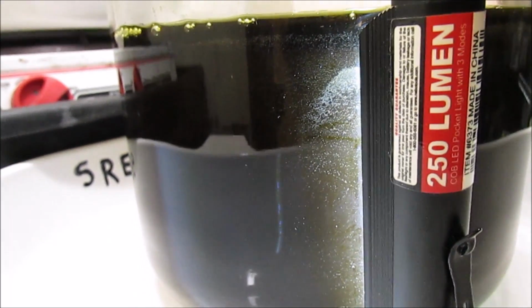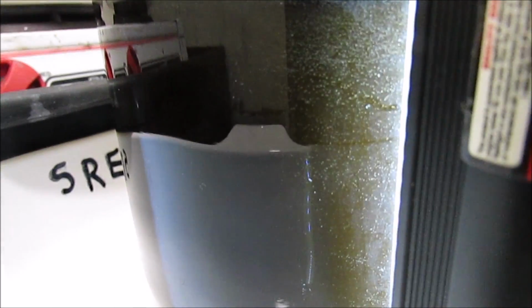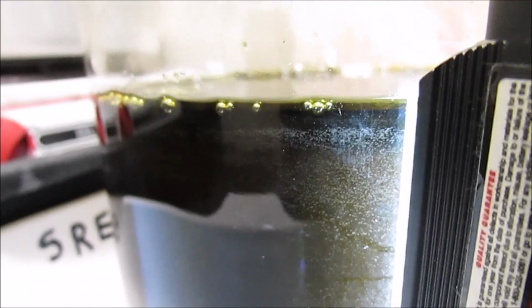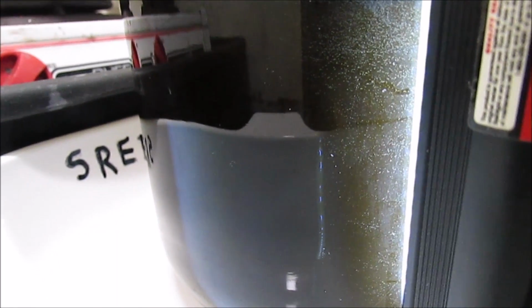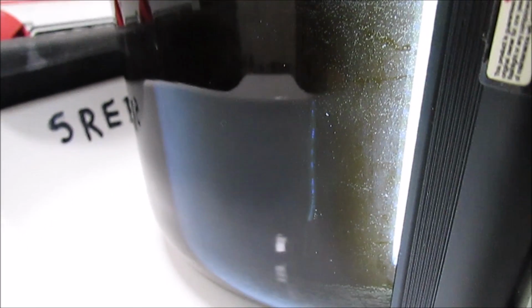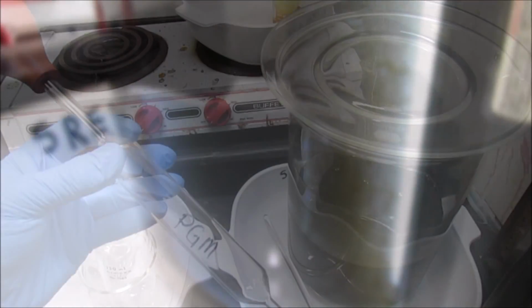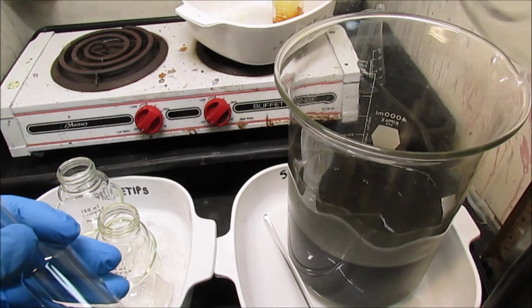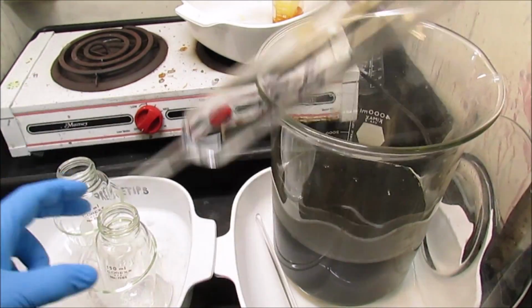I didn't have enough sodium metabisulfite in there earlier, and now I think I finally got enough in there. Everything's settling out. It's going to take a day or so to settle here. So let it settle until the solution is crystal clear. I know I shouldn't push it, but I'm kind of anxious to see what we got here.